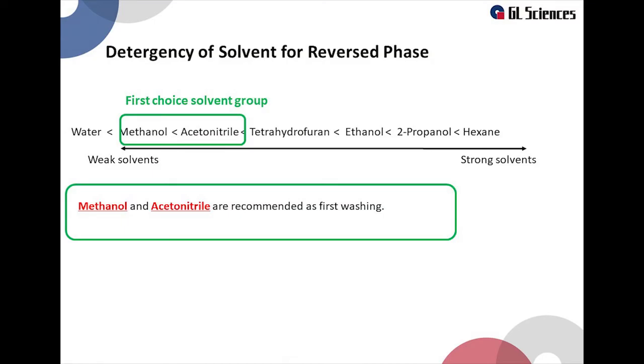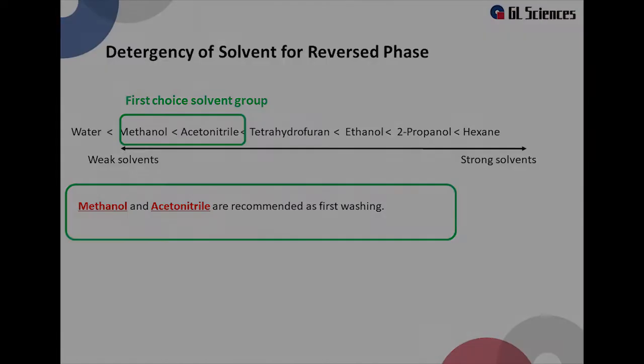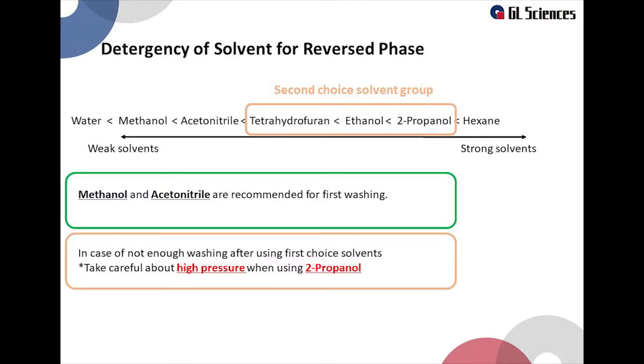We would recommend to start washing with either methanol or acetonitrile. They can easily be mixed with water. If the cleaning is insufficient with methanol or acetonitrile, increase the strength of the detergent for the second washing method. It is better to use tetrahydrofuran, ethanol, or isopropanol. These solvents have a stronger detergency.